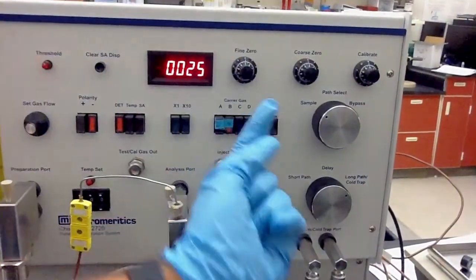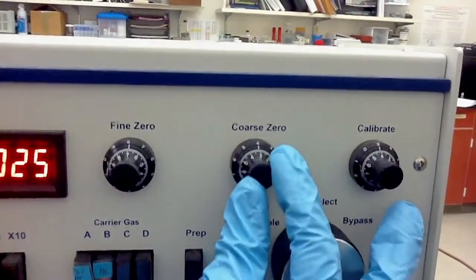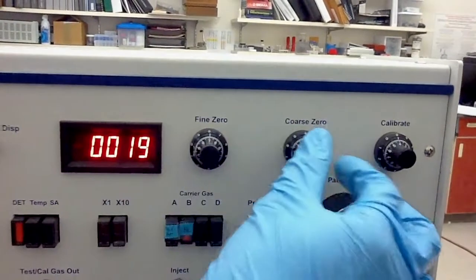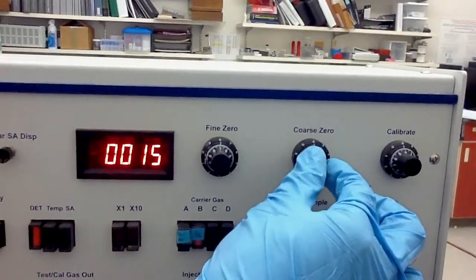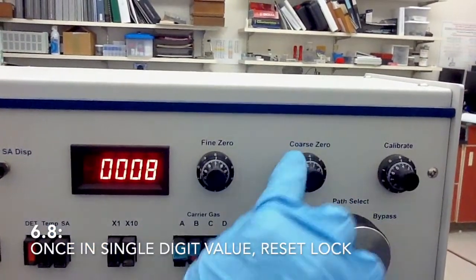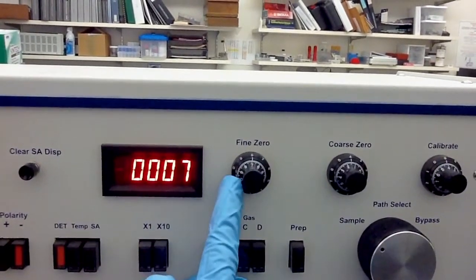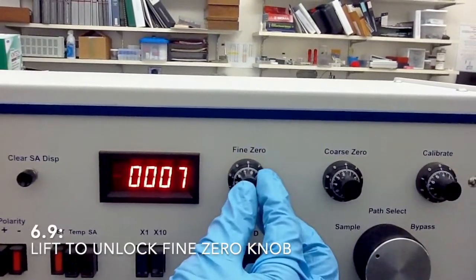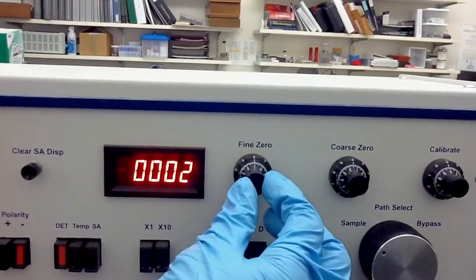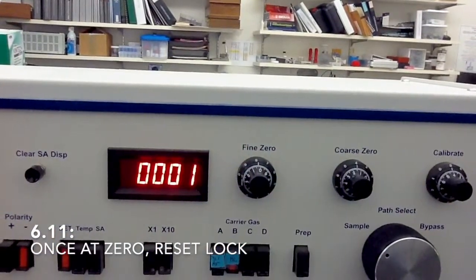It does have a lock. You have to pull it up, so this unlocks. Now you have to use this one to make it zero. If it's positive and you move it, you can see that it's going down. So once it's in one digit, you lock it back. Use this fine zero. The same thing, you have to unlock it, use this one to make it zero, and lock it back.